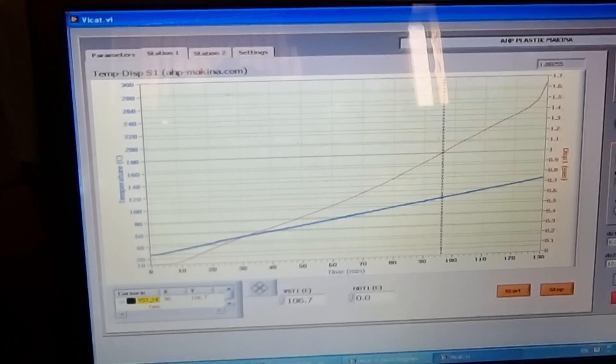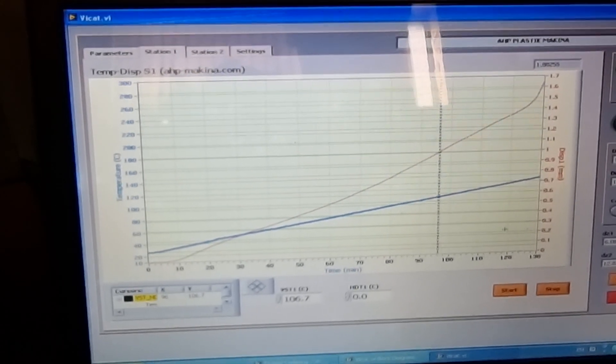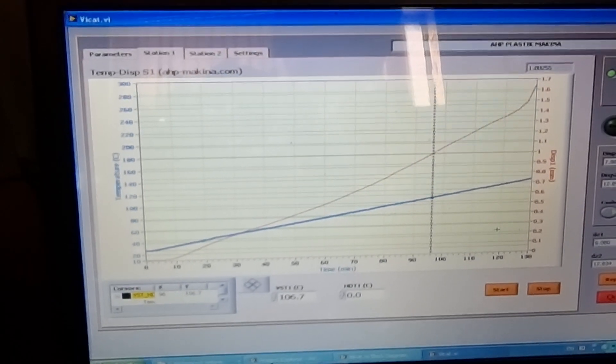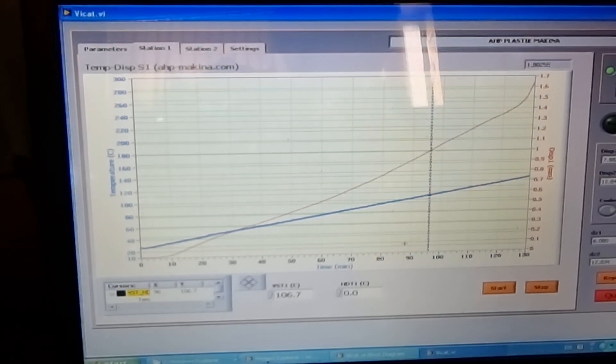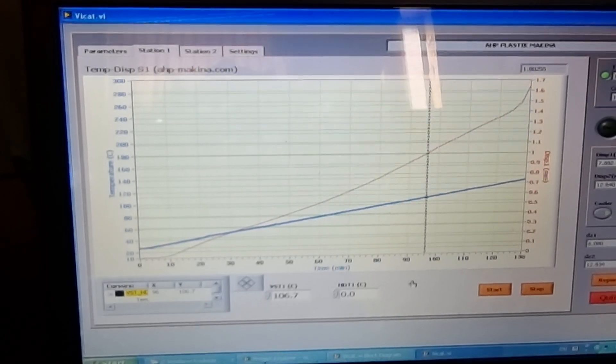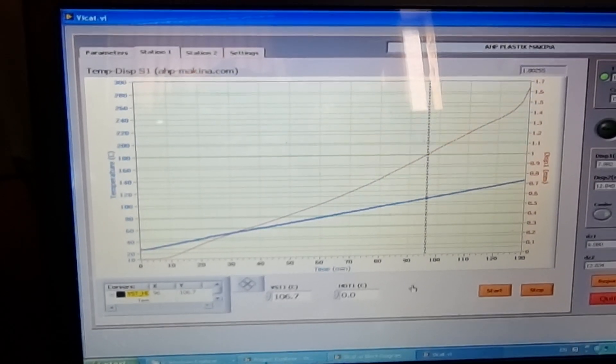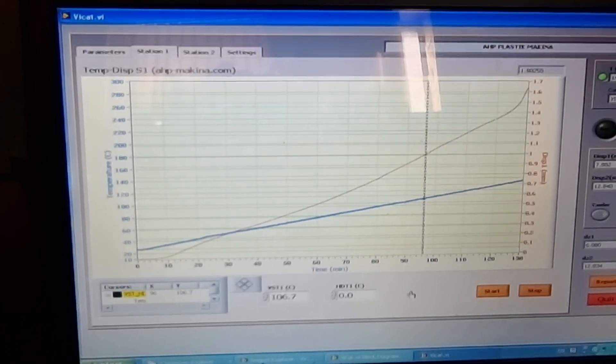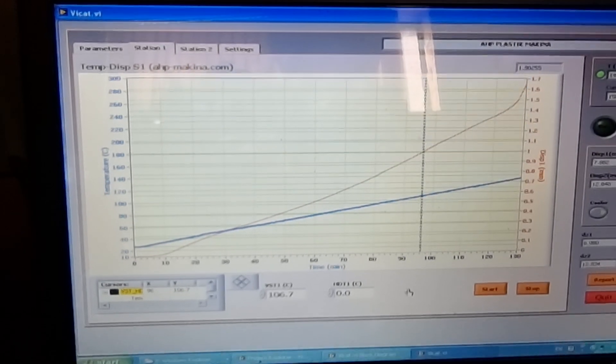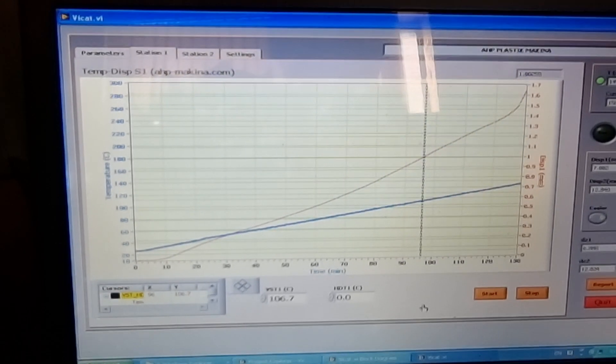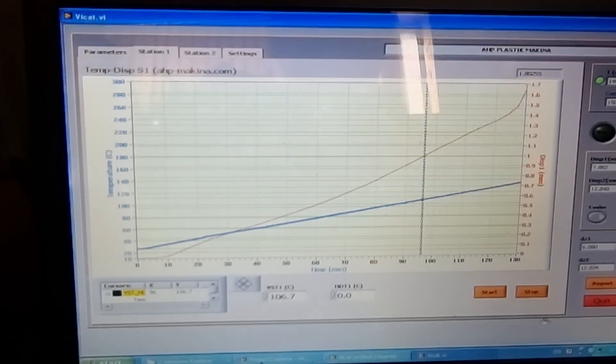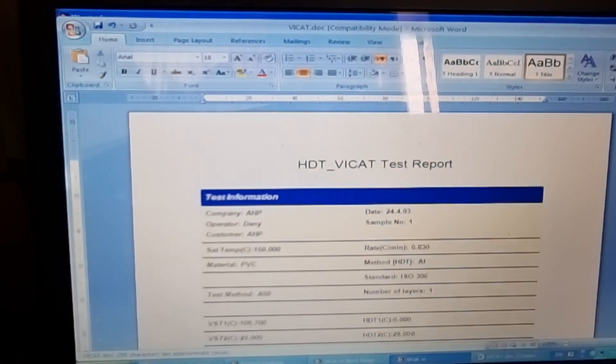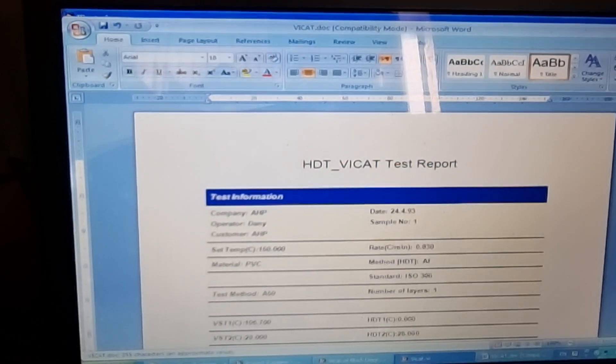When you click on report, you will see the report in Microsoft Word. The report will be like this.